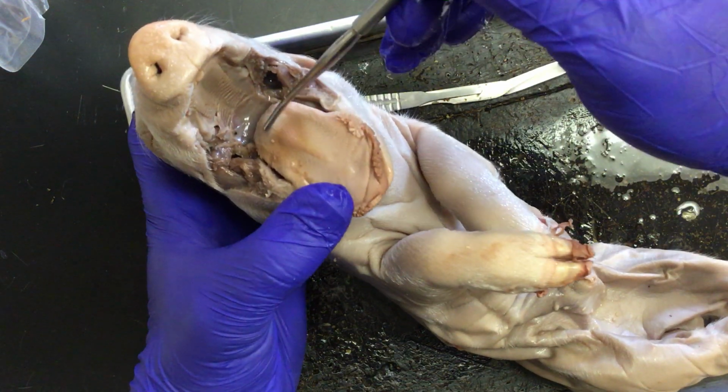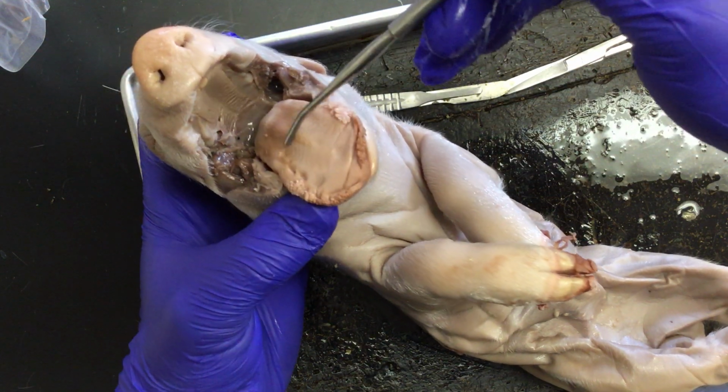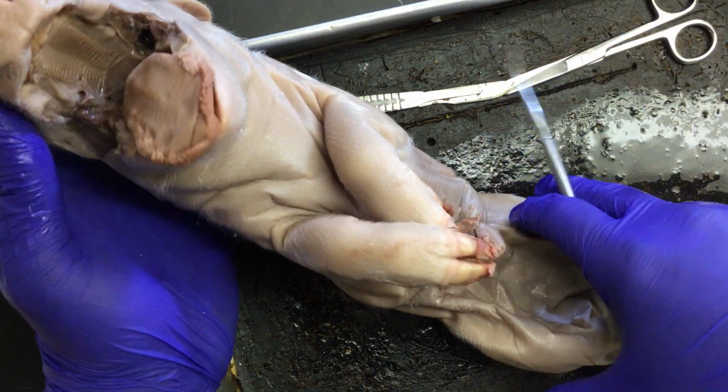Here we see the tongue and all of the taste buds, especially along the side here. It's easier to see these taste buds along the front, but there are tiny taste buds all along this tongue, very much similar to the taste buds that you have in your mouth.